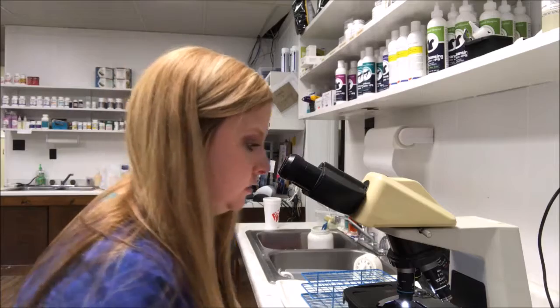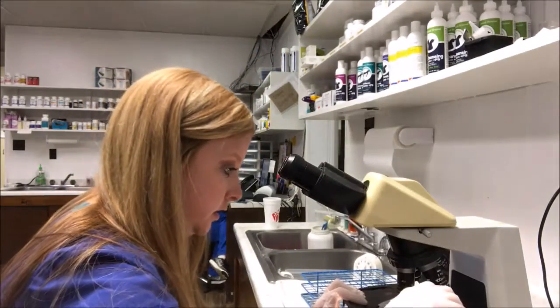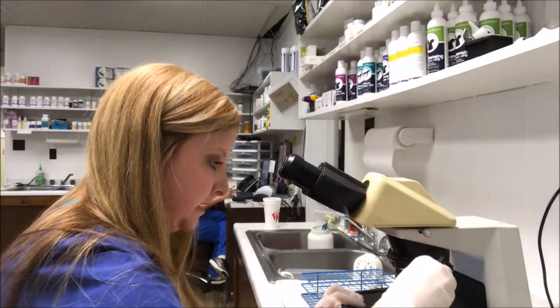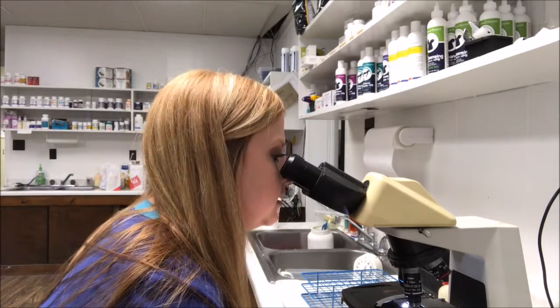And so now I'm going to go to the oil magnification at 100 and look at them here.